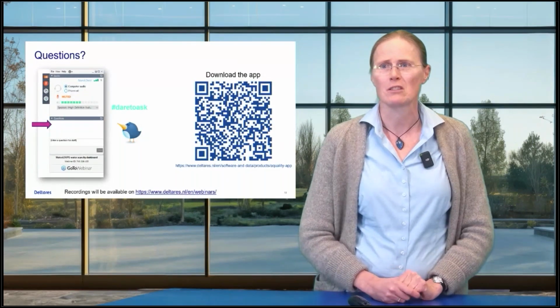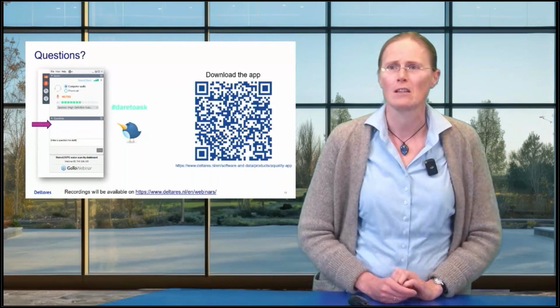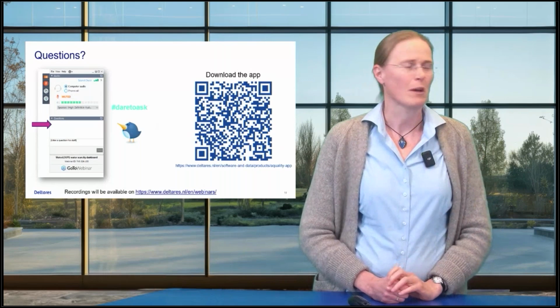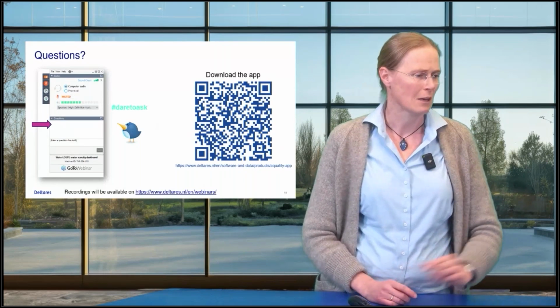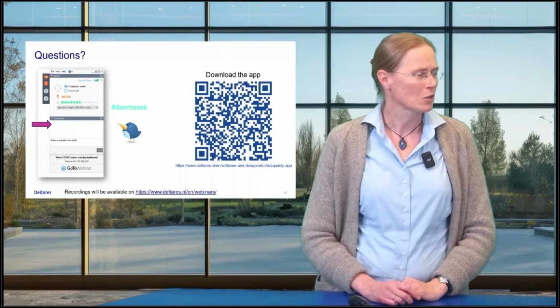There's another question here on how we can buy the tools before using the app. So I think this is related to the little measurement devices and also the salinity app and the little strips. Can you explain it a bit more?